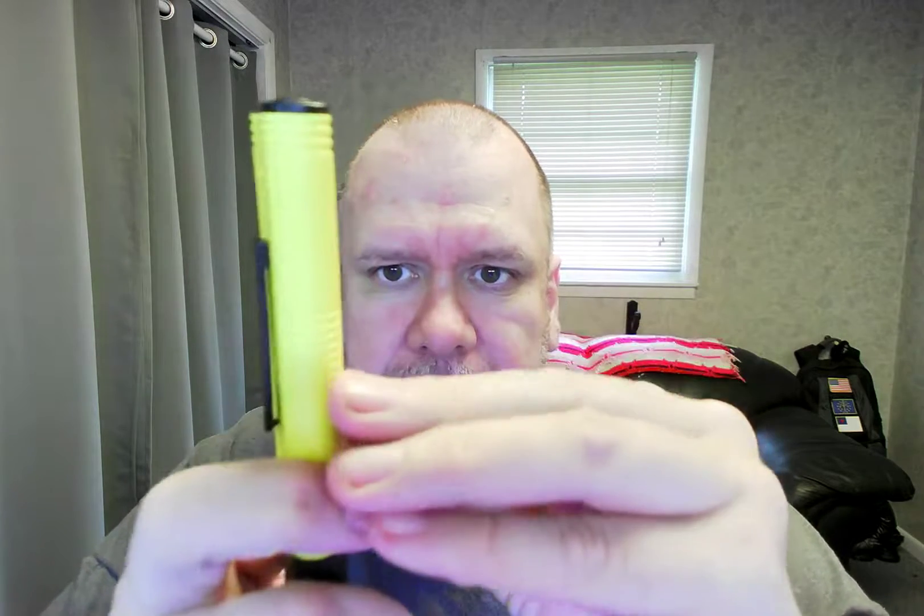Before we keep going, here's what the meter looks like. Got a little peely — peel that off. You've got an on and off switch. The battery's internal. Alright, so let's take it in the water and see what happens.